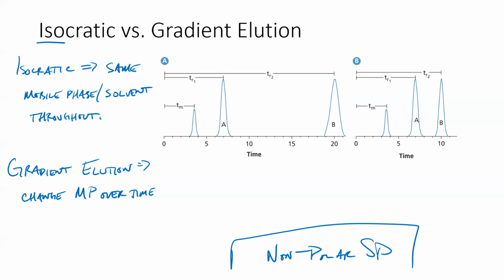Non-polar. For sure. And so I'm going to write those analytes in the same color. There they are. And our polar analytes, they're up here. Oops, that was a P. Right. And so if we have just one polar mobile phase, what's going to happen is that, you know what I'm going to do? I'm going to change these A's to B's so it matches our picture.